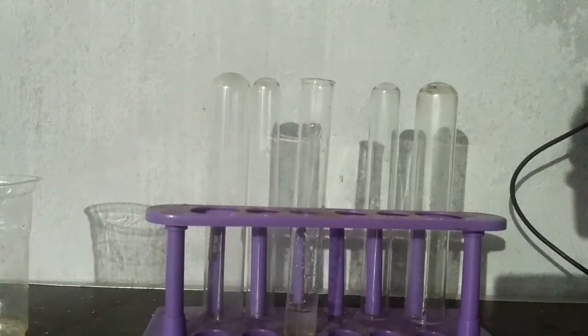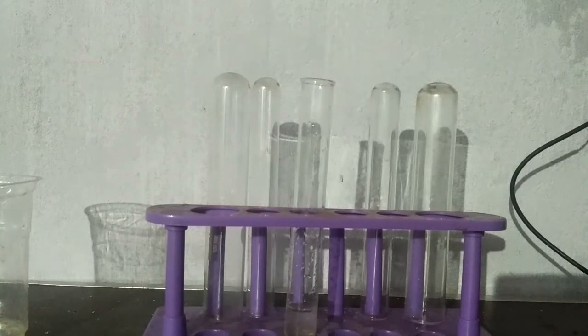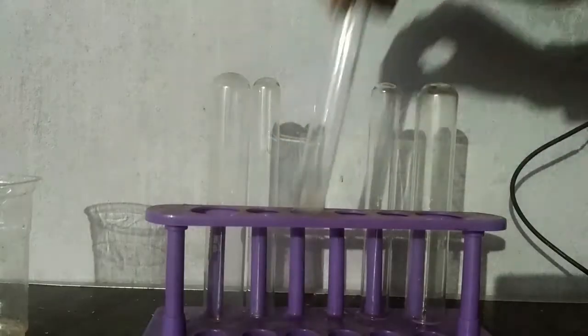To test for the magnesium ion, we first have to confirm the absence of group 0, group 1, group 2, group 3, group 4, and group 5. After confirming those absences, we will then check for group 6.